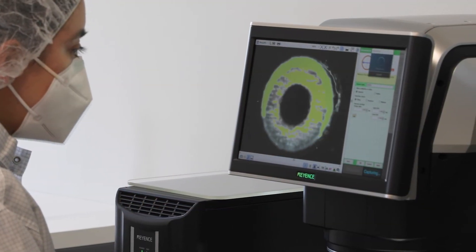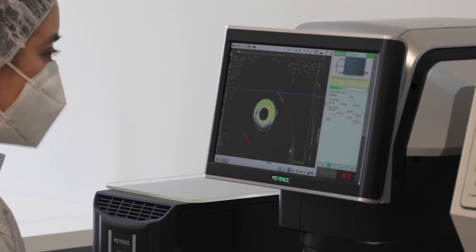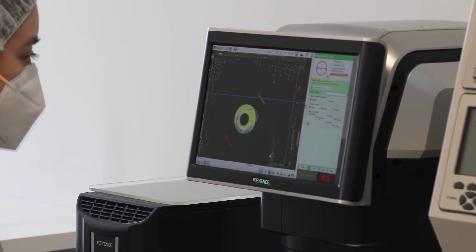Throughout the manufacturing process, there are quality assurance checks in order to ensure that our devices are up to customer specification.